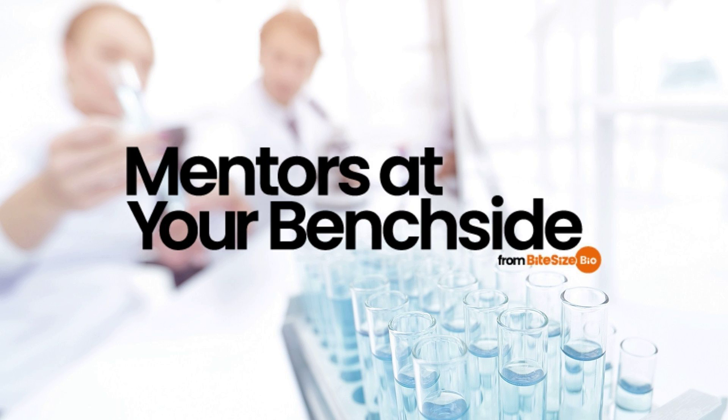Let's not get into single particle image reconstruction here because the theory and instrumentation are so advanced that they border on magic. Samples that are too thick cause A, molecules to lie at different focal heights in the microscope, B, scattering of incident electrons by the vitrified water, both of which lower the signal-to-noise ratio and tarnish the magic.